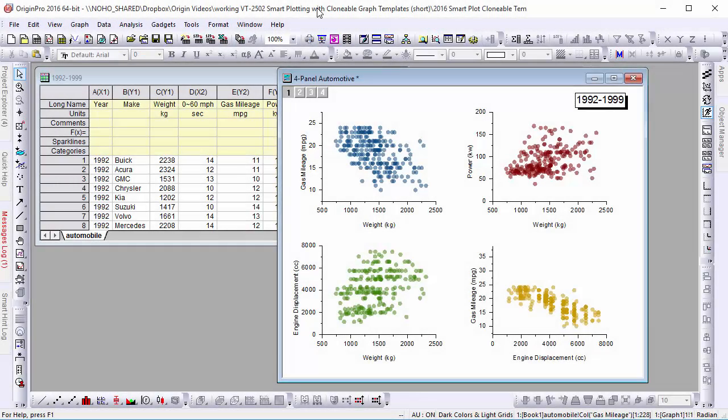Hi, this is Chris from OriginLab. I'm here to present a new feature in Origin 2016, Smart Plotting with Clonable Templates.